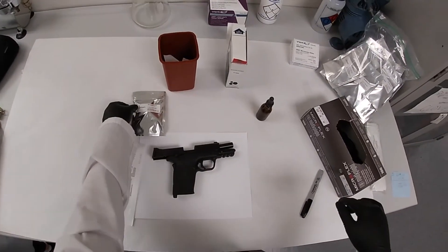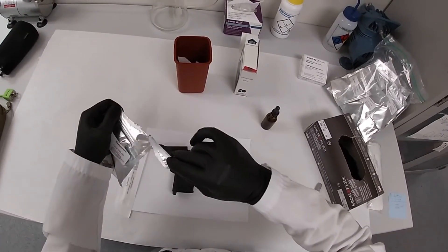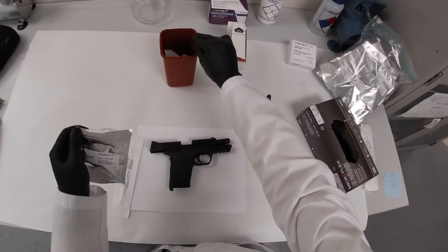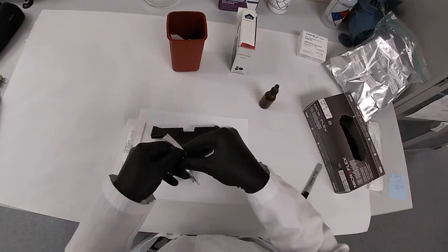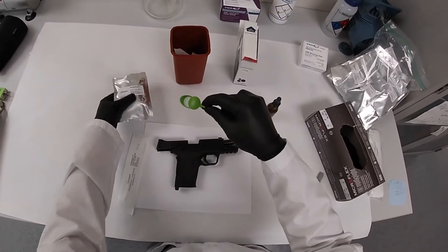Be sure to wear appropriate personal protective equipment. Remove the swab saver from the protective foil pouch and place the swab saver on the pouch.